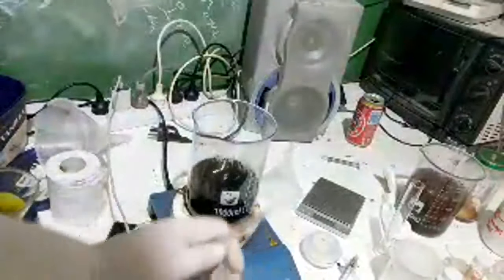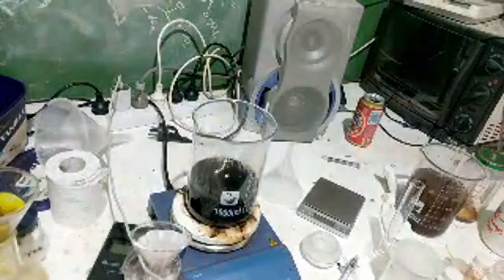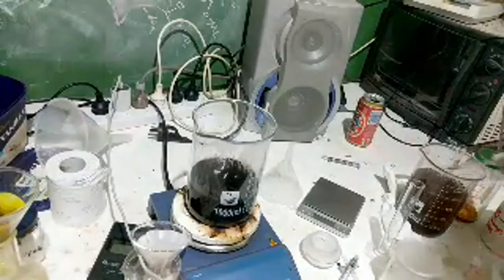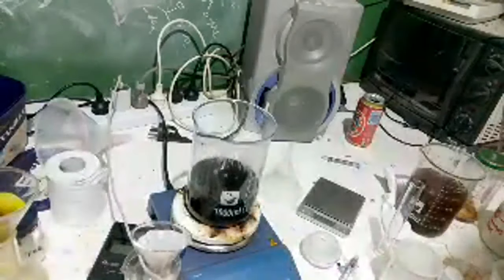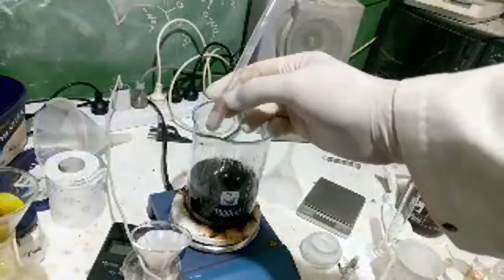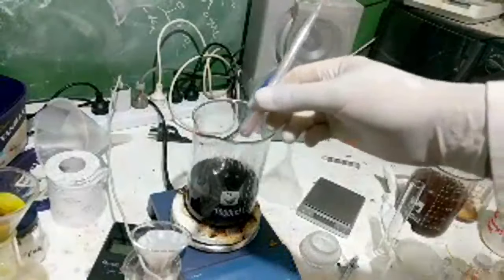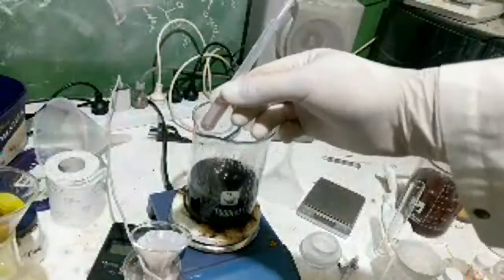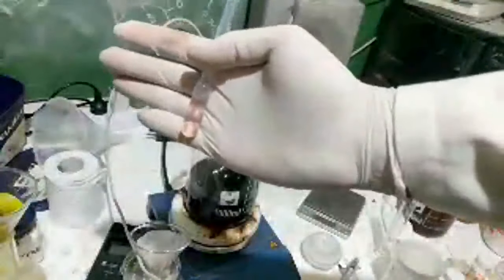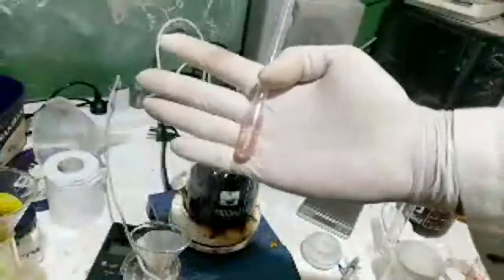Well, I'm going to let these things run overnight. Maybe we'll come back to heaps of ferrate in the morning. But I think it's looking slightly pink. Like that, that's not too bad, right? Alright, I think that's good. You would say that's purple? How big are the pixels? Yeah. All I want is purple.